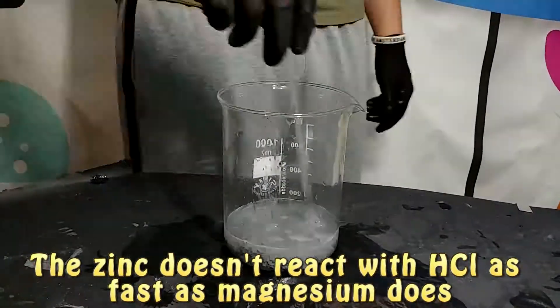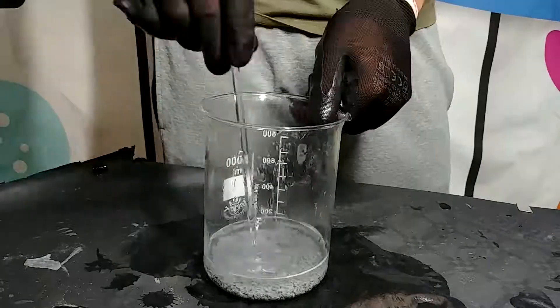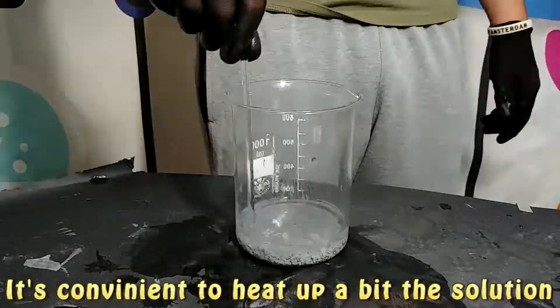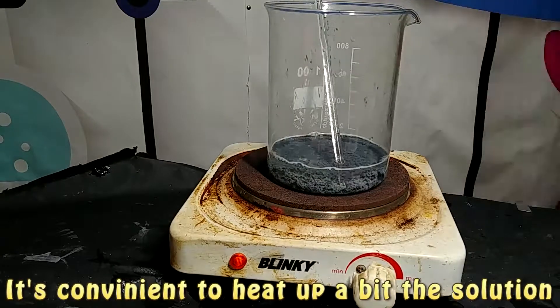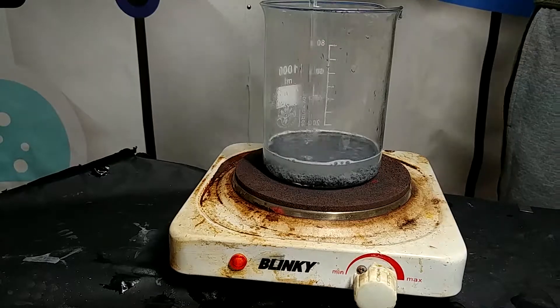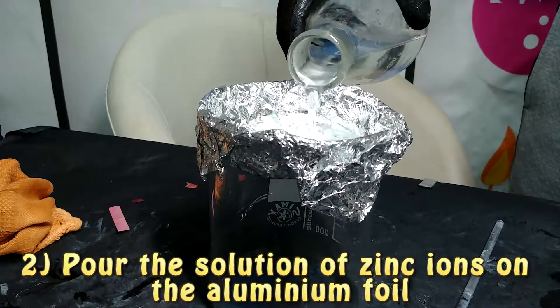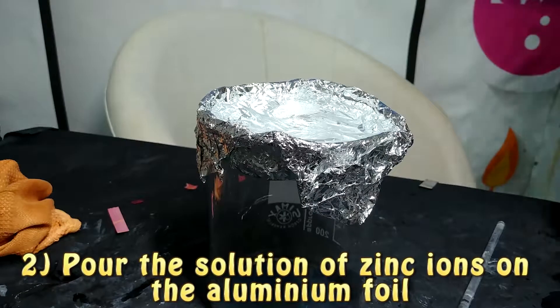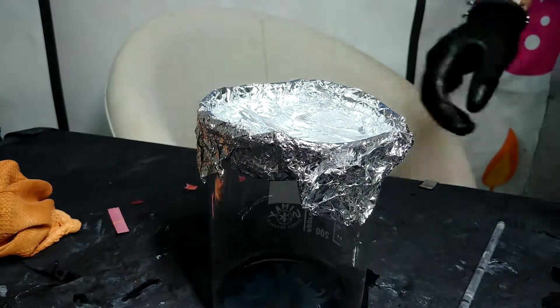After that, we will take the solution we have obtained, filter it, and then make it react with aluminium foil placed on top of a beaker to form a small bowl. We will pour the solution into it along with some table salt solution. We will then observe that the reaction isn't happening much — we only see a little bit of bubbles forming.